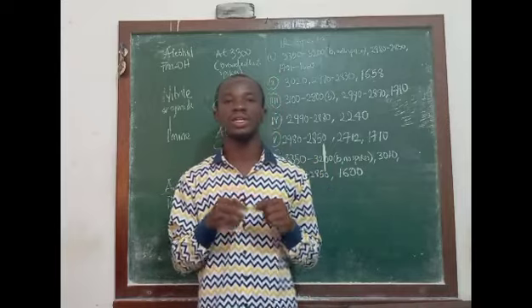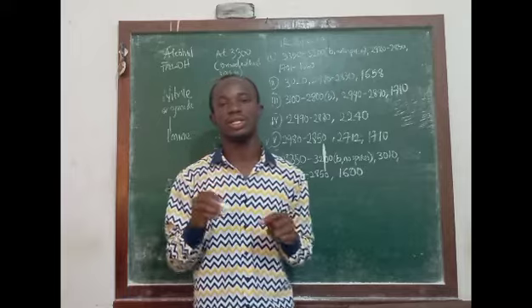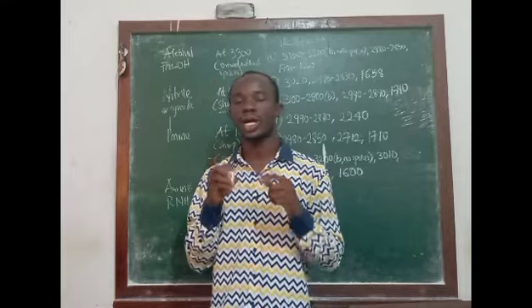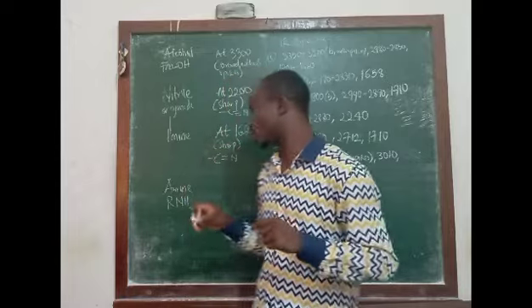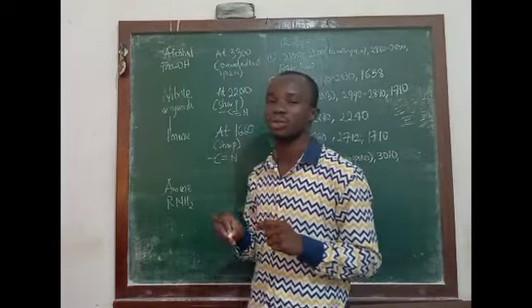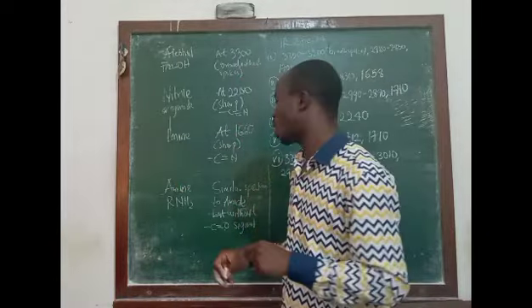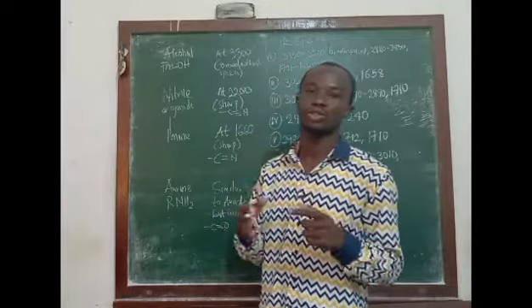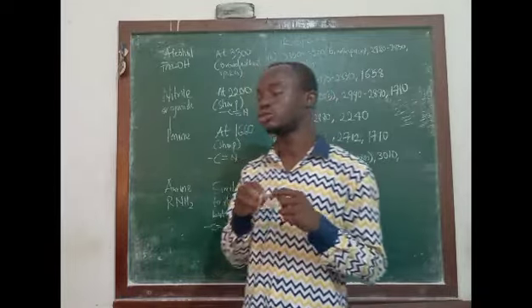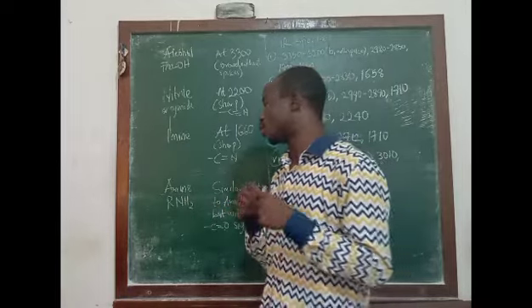So it implies that if I see a signal around 3,300 which is broad and with spikes, but I could not see a signal for a carbonyl functional group, that should tell us that the compound represented by the spectrum will be an amine. So a spectrum that has NH2 stretching vibration but does not have a carbonyl signal will simply represent your amine.